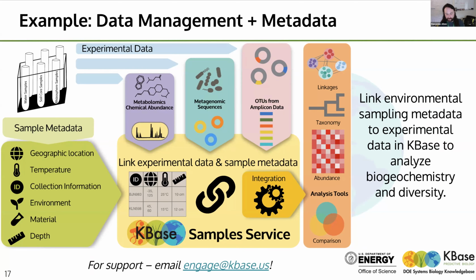But just know that if you have, for instance, amplicon data that you're looking to link to genomes that are your own genomes or in these public repositories, we are building out a service that allows you to host your experimental data and sample metadata and analyze that in the context of this public data as well.